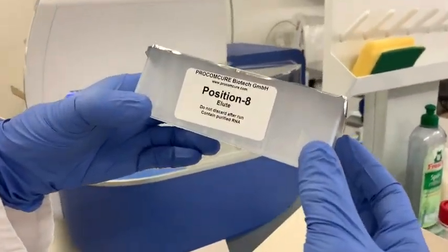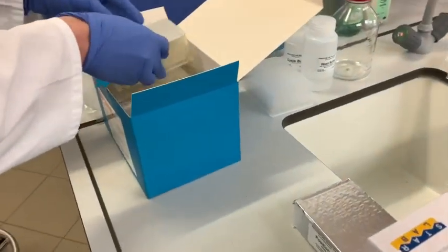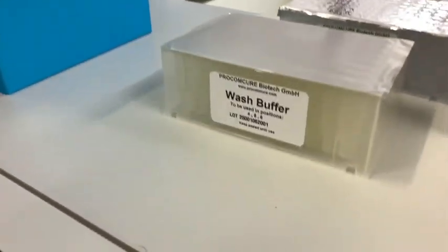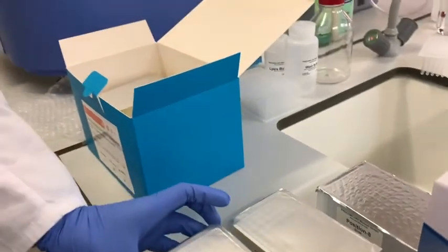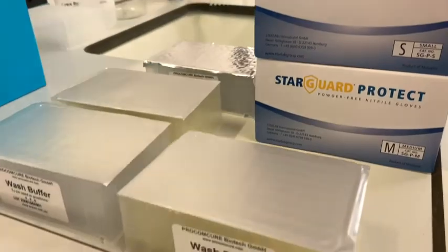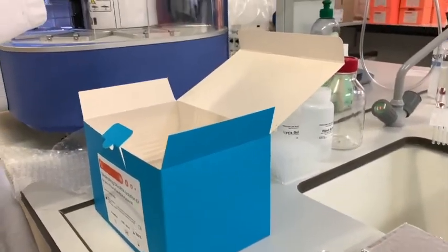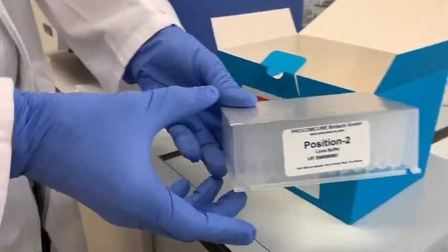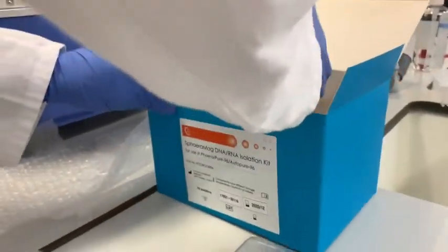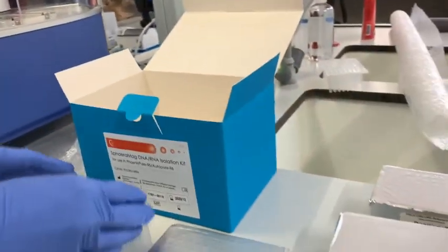At position number 8 is the elution plate. At positions 4, 5, 6 come the wash buffers. The most important one, at position 2, is the lysis buffer. Finally, at position 1 is the magnetic rod.